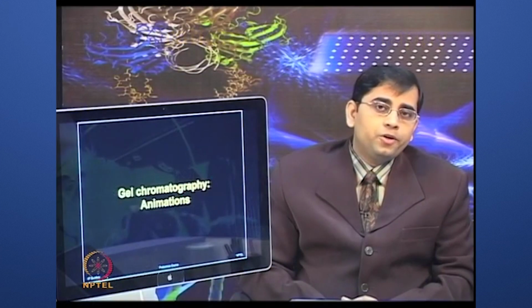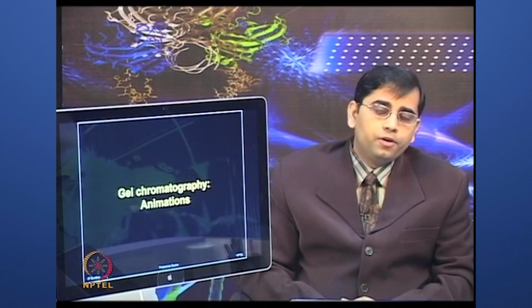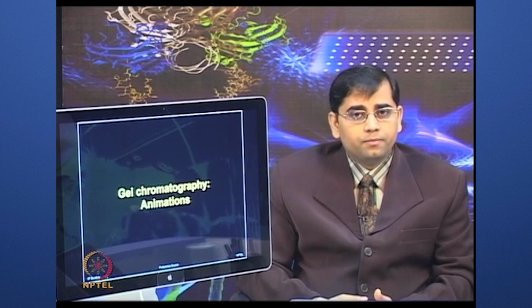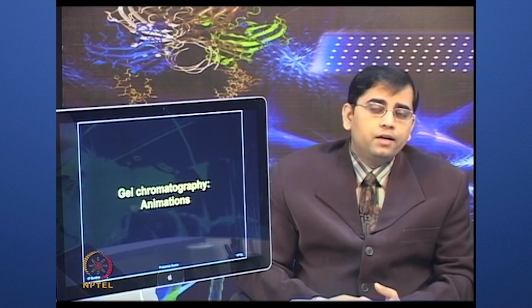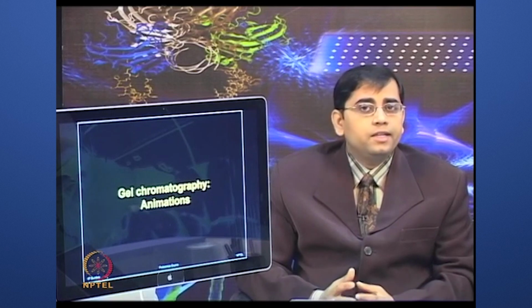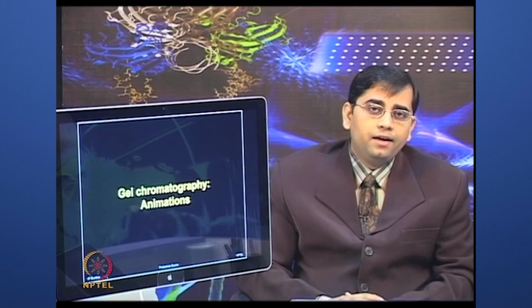So, gel filtration chromatography is useful for removal of contaminants, doing desalting steps, as well as for buffer exchange. However, its drawbacks are its low capacity, broad distribution of pore size and small sample volumes to be analyzed.